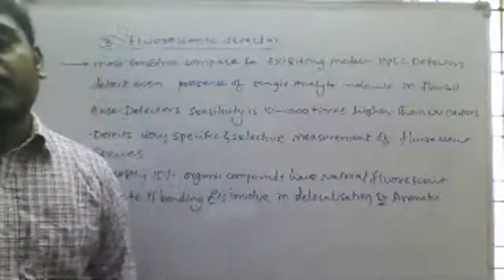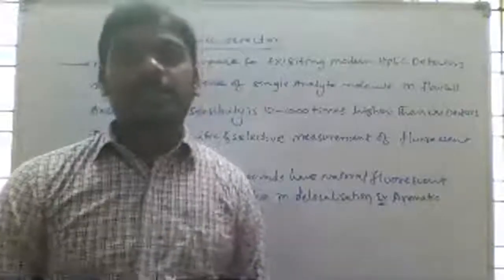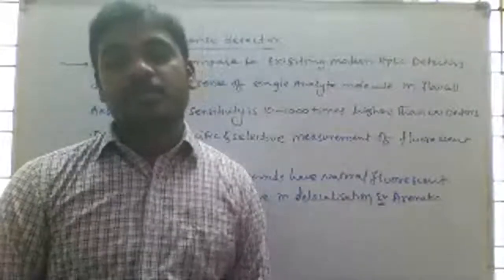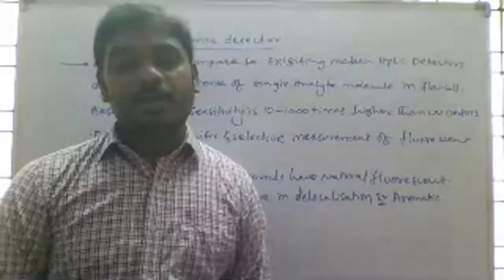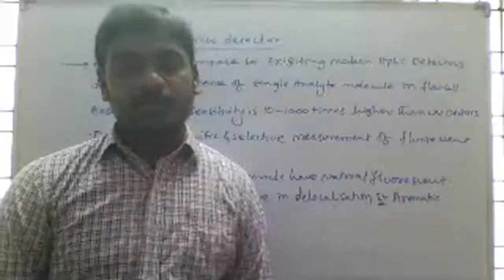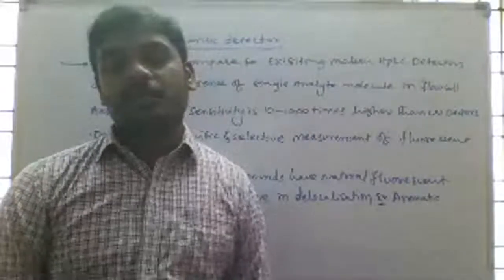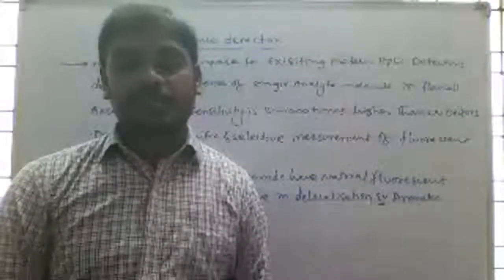Fluorescence intensity depends on both the excitation and emission wavelengths. Fluorescence detectors available in the market differ in the method by which the wavelengths are controlled. Less expensive instruments use filters for the wavelengths, and medium priced units offer a monochromator controlling at least the emission wavelength.